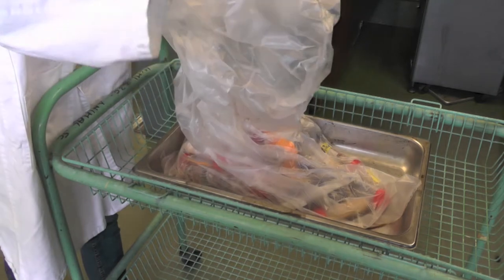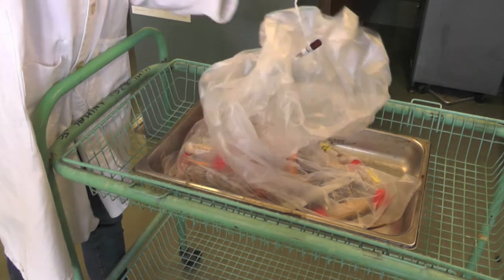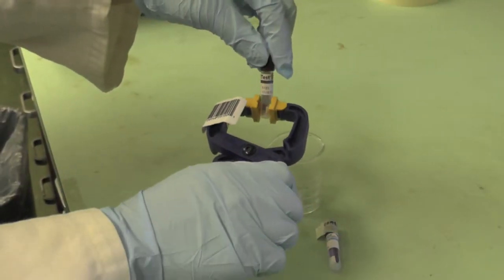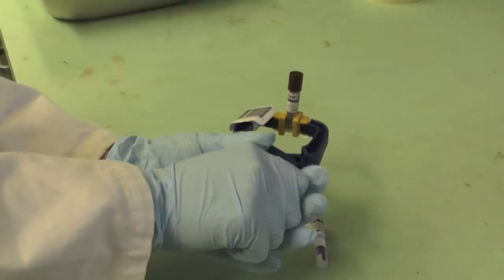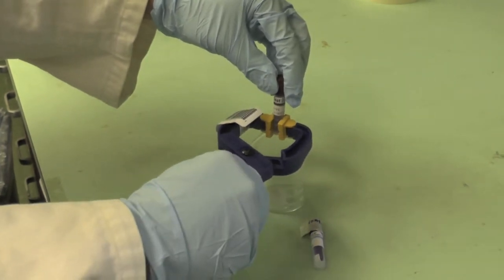After autoclaving, pull the biological indicator out of the bag by using the string attached. Allow it to cool for 10 minutes. With a plastic crusher, carefully break open the autoclave biological indicator ampoule along with a control ampoule. Place the two indicator ampoules in a small beaker.